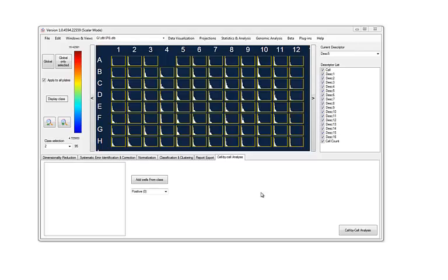And welcome to the HCS Analyzer tutorial on cell-by-cell analysis. This is chapter number 3, where we will talk about how to perform cell-by-cell classification.